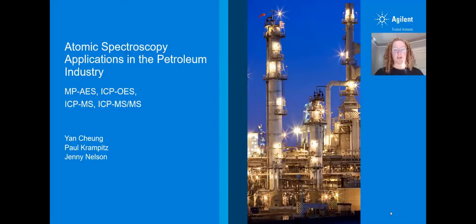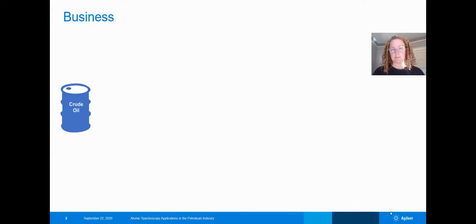Thanks, Paul. Thanks, Yan. Hi, everybody. My name is Jenny, and I'll be joining you remotely from my office in Berkeley, California. While Yan and Paul are setting up their laboratories to take you inside, I'm going to share with you some slides on the atomic spectroscopy applications in the petroleum industry. Today, we're going to be covering applications with the MPAES, the ICP-OES, the ICP-MS, and the ICP-MS/MS.